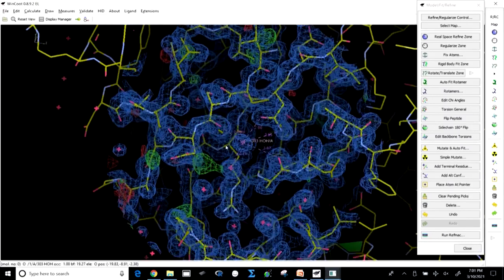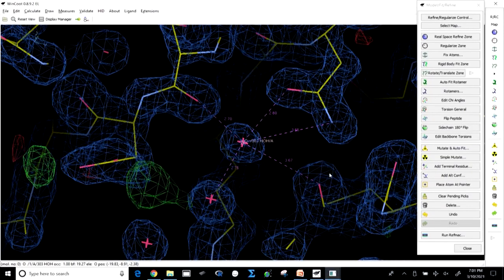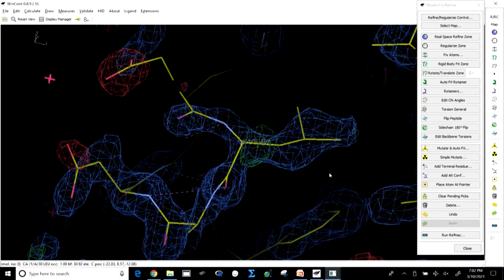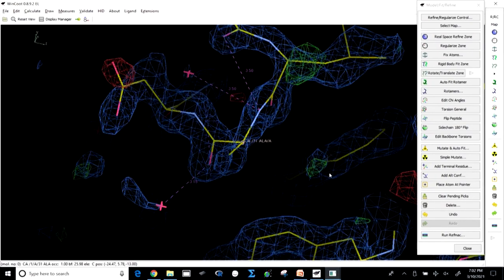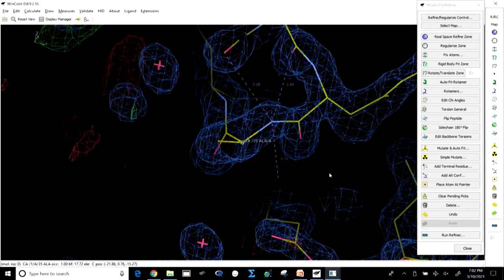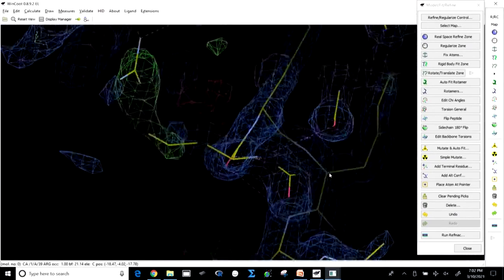Now, if you go somewhere, you see the interactions, but the better thing is you could just continue by clicking the shift bar. Now, you could click and shift and you see all the interactions.